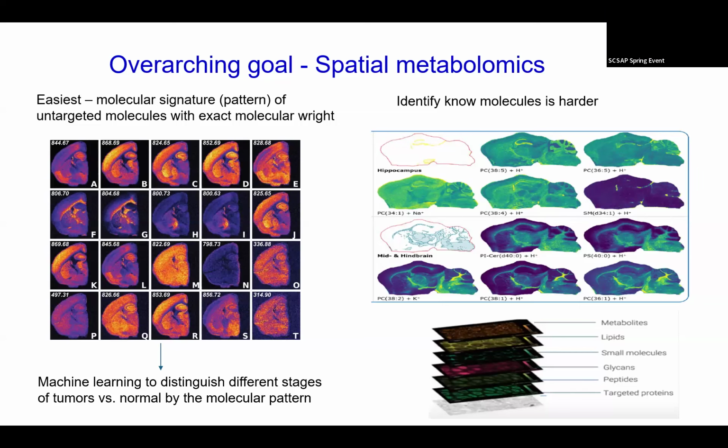In the future, I envision we can scan every single tissue, much like HE staining. Then, with every tissue carrying all the molecular weights, you can do pattern recognition. With machine learning algorithms, people can start to distinguish tumor from normal. But so far it's too much work, and I don't think people have accumulated enough images yet. I can imagine that in the future it may be a tool very similar to HE staining, but with molecular information and much higher resolution.